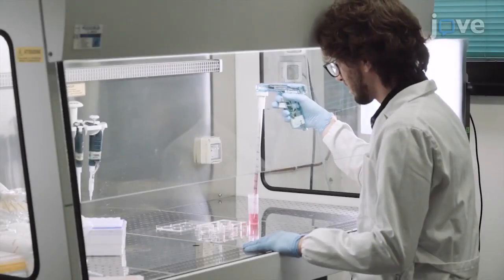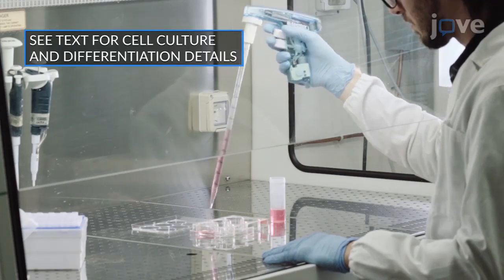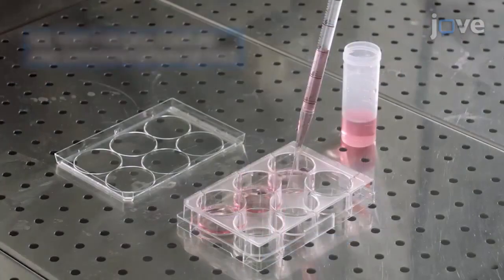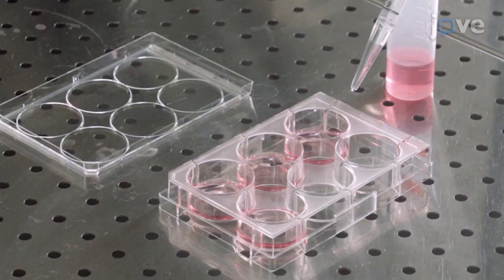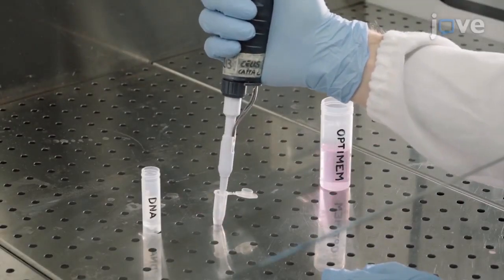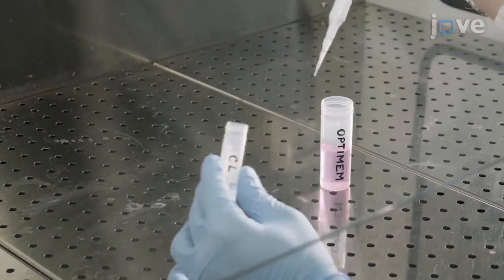Begin by plating 4 × 10^5 SH-SY5Y human neuroblastoma cell line cells to be transfected with the empty control vector, 4 × 10^5 cells to be transfected with untagged tau, 4 × 10^5 cells to be transfected with tau NLS, and 4 × 10^5 cells to be transfected with tau NES into individual wells of a 6-well plate.